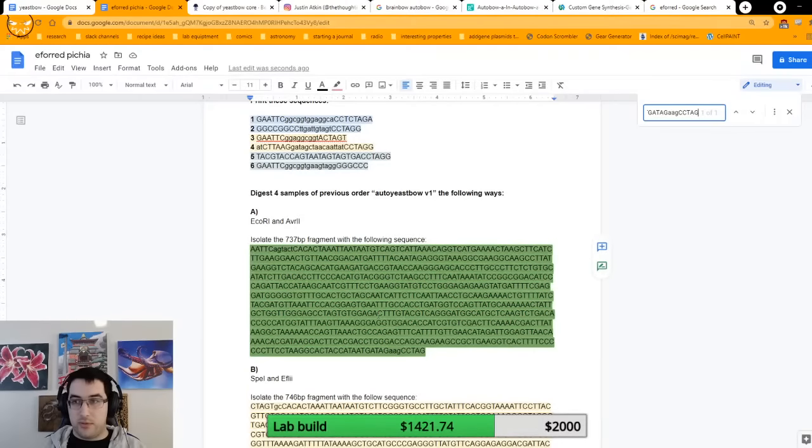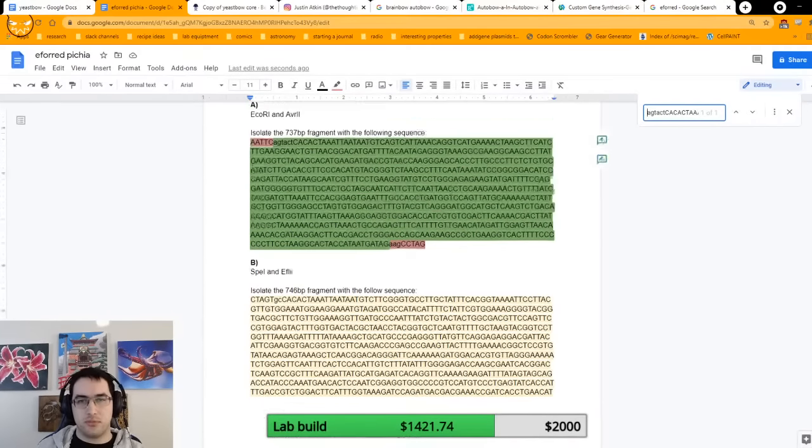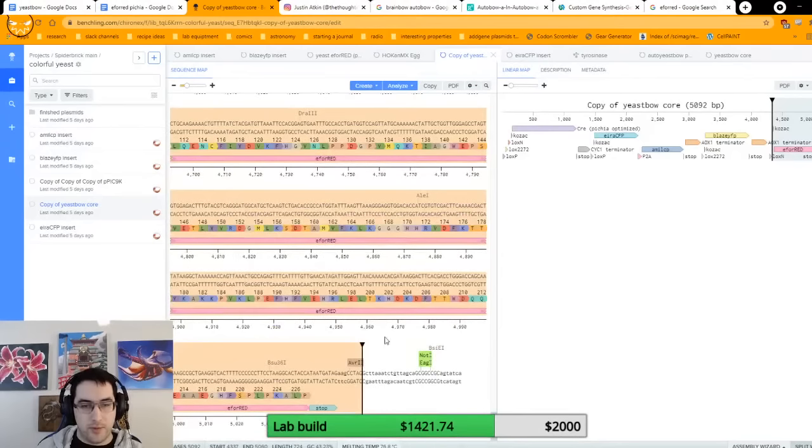But now, if I go copy FV, it's still the only one in there. What the fuck? What? Come on, man. Okay, this might... I mean, maybe this doesn't like the restriction sites. Let's cleave some of that off. Right? Like, at which point does it freak out? ATTC. Right? Right? I'm copying the right thing, so why the fuck isn't it?